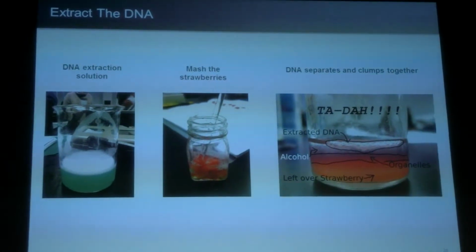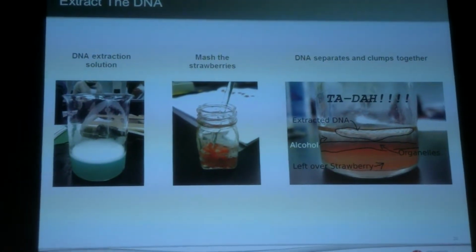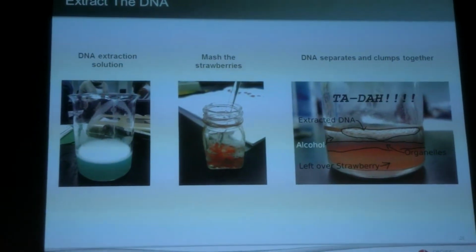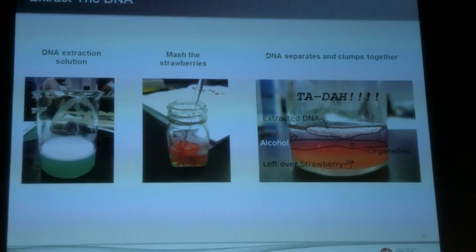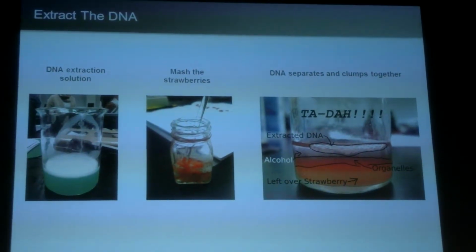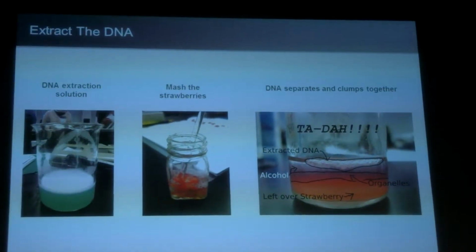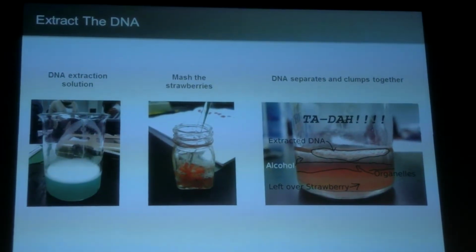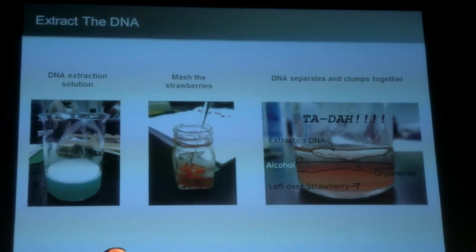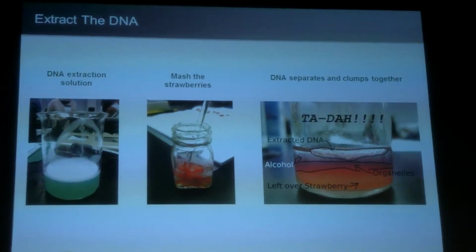In some form or another, you're going to be breaking down the cells. Human cells, you typically lyse them, and there are standard methods in the laboratory to lyse cells. In the process, the DNA will typically clump together. You can extract it out and purify it so that you've got nothing but the DNA. That's the starting point for where we go. Typically, people that want to run our instrument are sending in DNA, saying, tell me what it is. And that's usually where it starts.